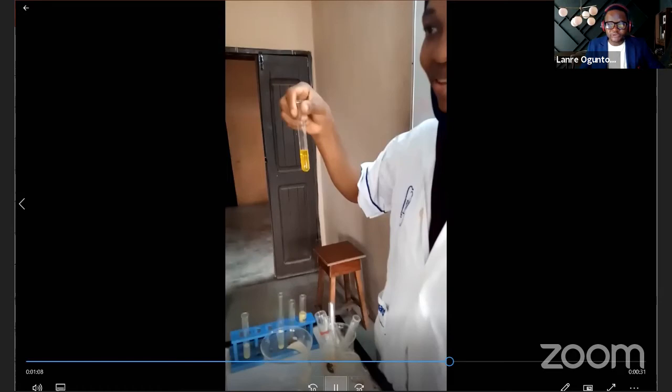Okay, so let me read a question from the chat room. Okay, could you show the table? Okay, good. Somebody is asking, during the iodoform test, why do you have to put it in water? Why do you have to put it inside the water?